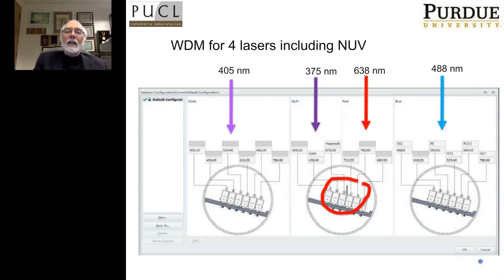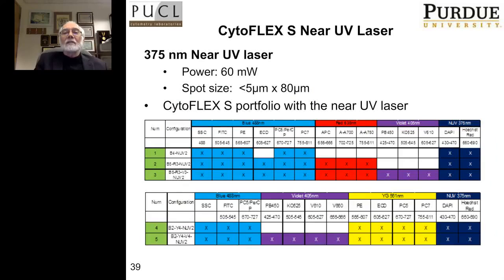So I'm just highlighting there the detector that is split, and here I've again highlighted that I can measure the side scatter from two different lasers. Now, I don't have to. I can put in one or other of these green arrows any appropriate bandpass filter. There's really no limitation to which filters. The only limitation, of course, will be the bands that are actually coming from that laser.